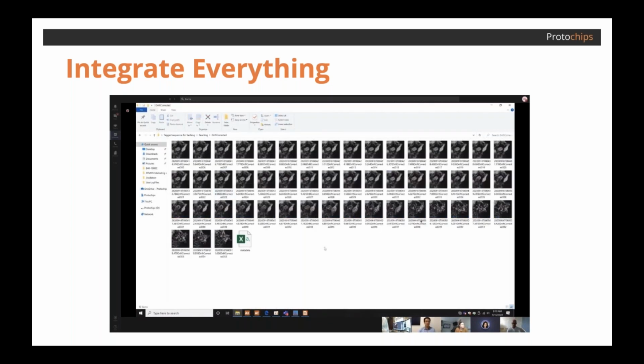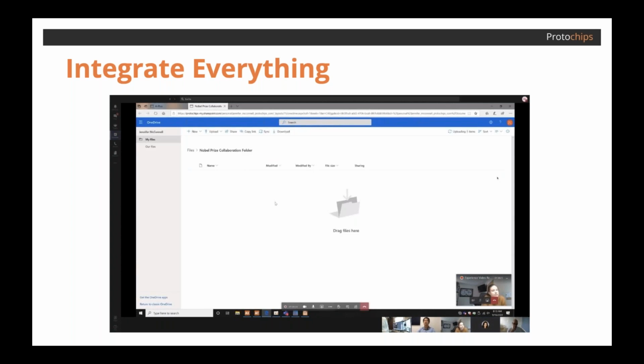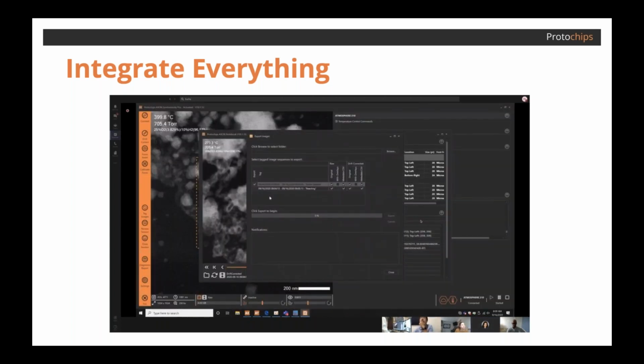Your data packages are tens of gigabytes instead of hundreds of gigabytes. And so you can immediately upload it and share. This removes the burden from the operator to align everything just for a subset of data to quickly send. And it satisfies the researcher with a quick and accurate data set.